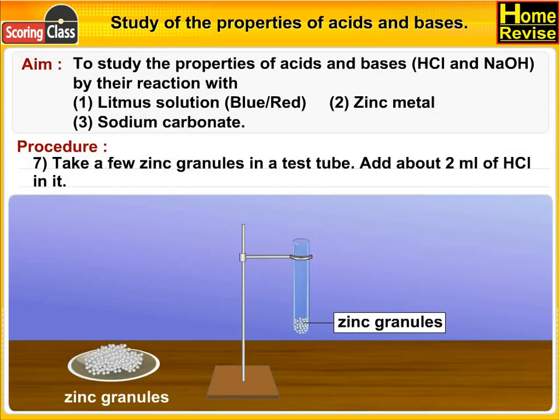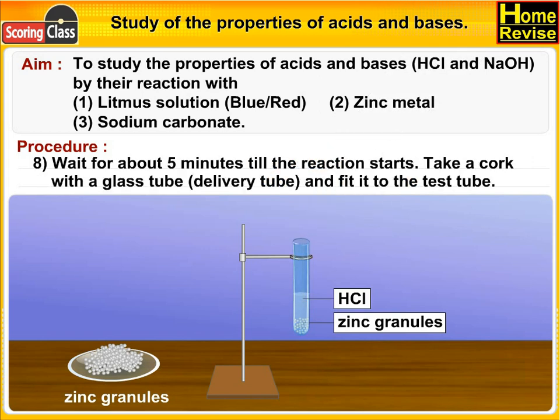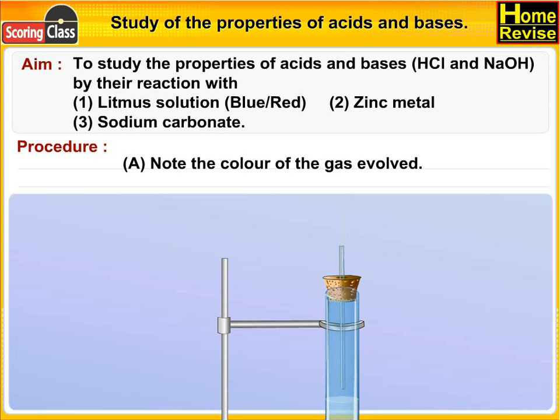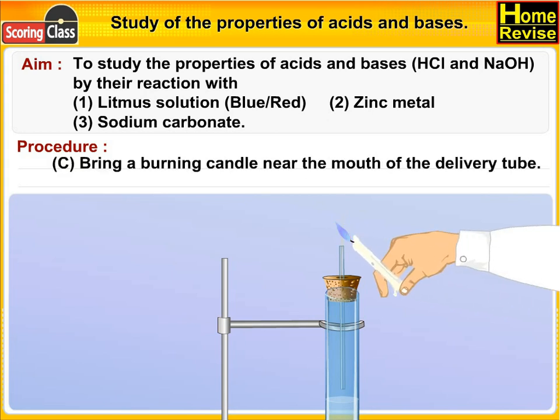Take a few zinc granules in a test tube and add about 2 ml of HCl. Wait for about 5 minutes till the reaction starts. Take a cork with a glass delivery tube and fit it to the test tube. Note the color and odor of the gas evolved. Bring a burning candle near the mouth of the delivery tube.